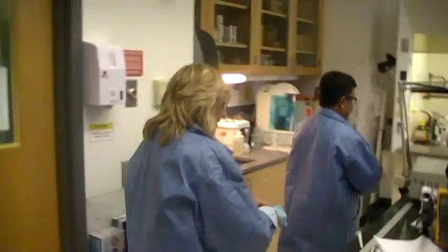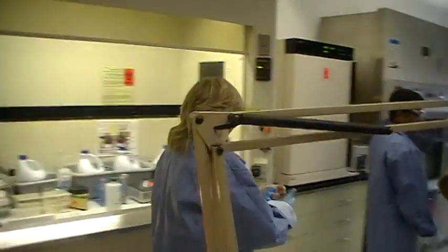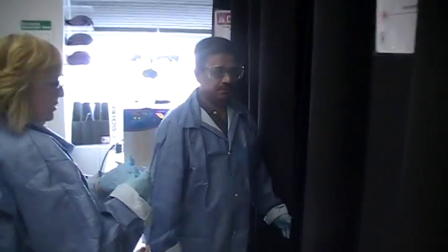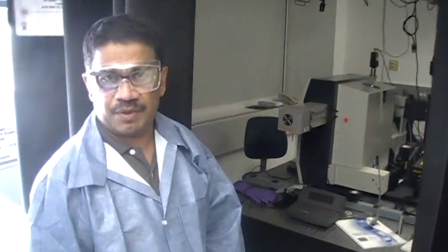If you want to follow us, we'll just come around to the other side first and then we'll show you how this works. Right now we're going into the lab where the laser is, where the commercial grade instrument is. We need to black it out to record the spectra — this has to be totally blacked out. Room light can have an effect on the spectra.